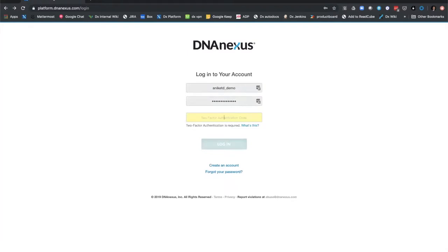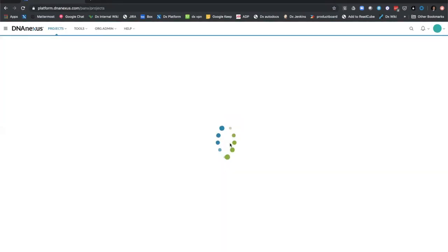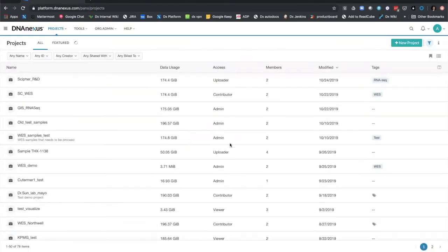Once I click log in, it takes me to the two-factor authentication. This is an optional security feature that we've built in. I can go ahead and add my two-factor authentication code that's sent to my mobile device. Once I enter the right code, the next page is the DNA Nexus projects landing page.